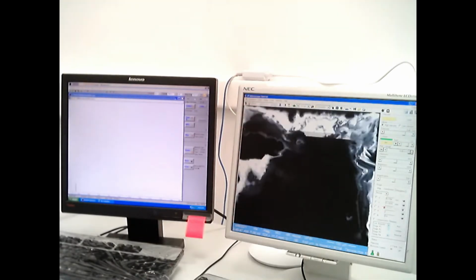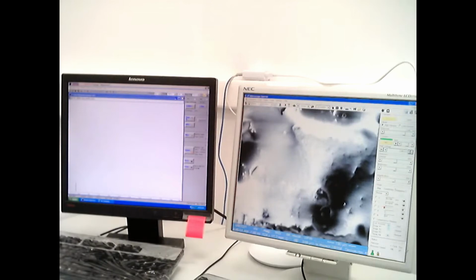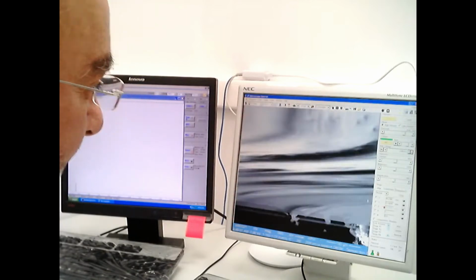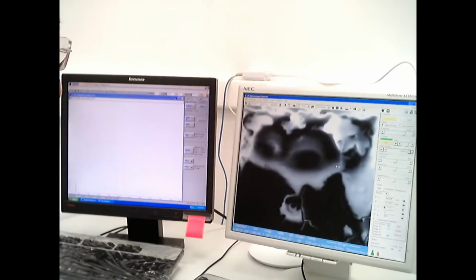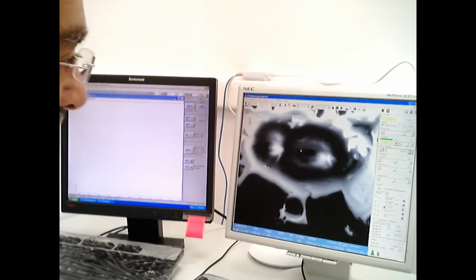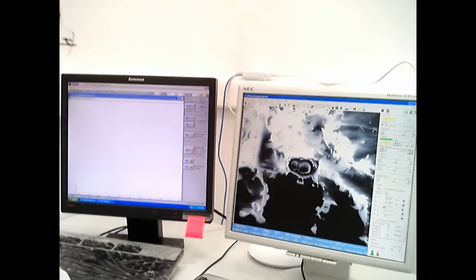It's a pity that the picture is not very good. Let's see what we can do about it. There is a tiny amount of material that looked very similar to blood. And in fact, if we do the investigation and the test, we can see that these things are the red blood corpuscles. The shape of the blood corpuscles can give us information, and when we analyze them, it can tell us whether it's animal or human blood or things like that.